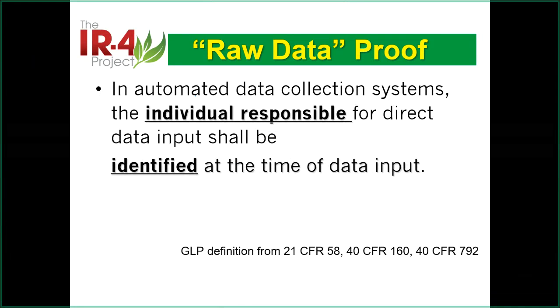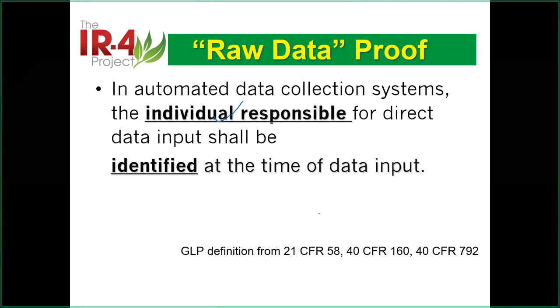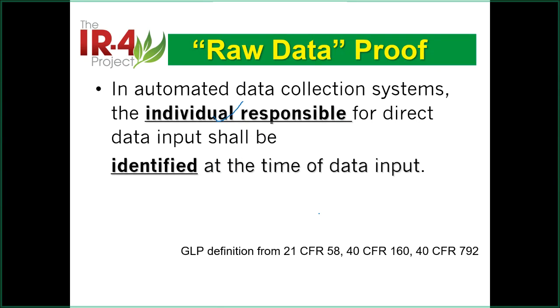The signature most likely should be the person who is responsible for doing the work. Or sometimes your supervisor can override your work. For example, with electronic data, you need a higher rank to make the change. You need to identify that, because at your level you cannot make this change, even though this is your mistake.